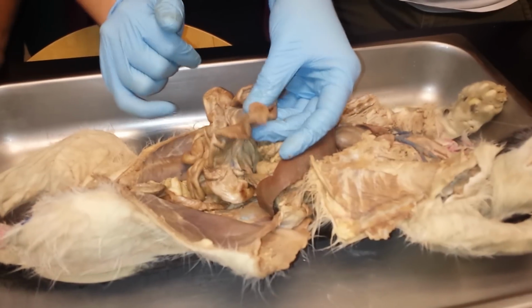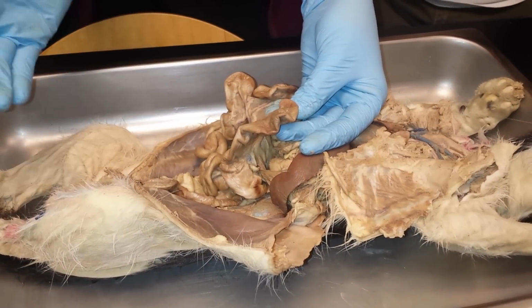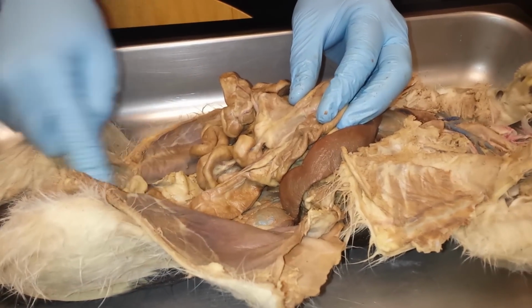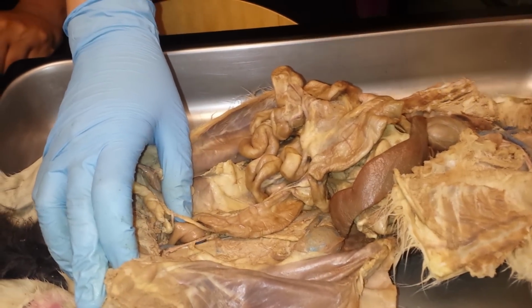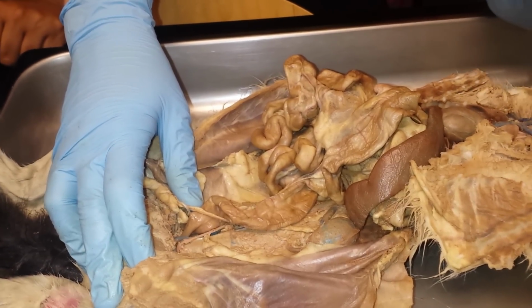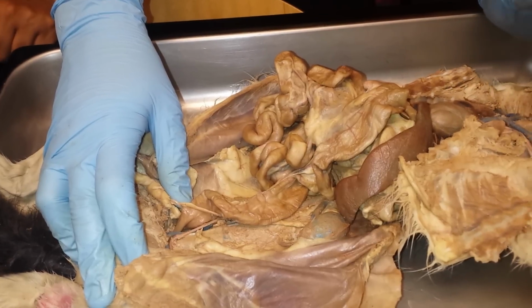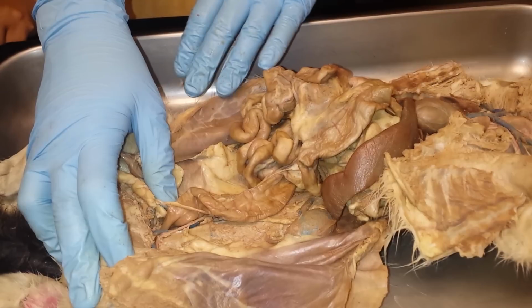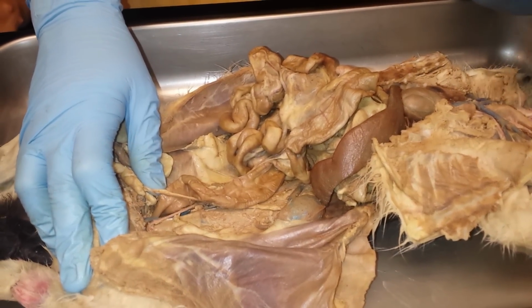Embedded in this cecum area, you would find the ileocecal valve, which regulates the passage of the chyme from the small intestine into the large intestine. Here's the large intestine, which travels down and descends into eventually the rectum and then the anal canal. Cats don't have an ascending, transverse, and descending large intestine or colon like humans do. Okay, so in the human models, you would have to be able to identify ascending, transverse, descending, and sigmoid colon or large intestine. You don't have to do that in the cat. It would just be large intestine. Okay, or if you want to say descending large intestine, right?